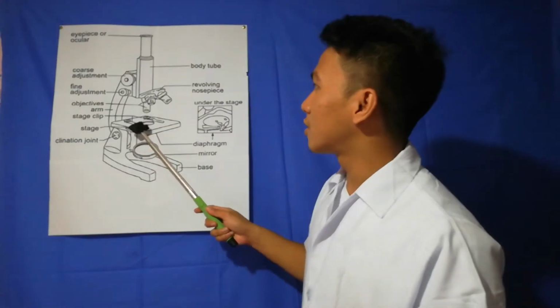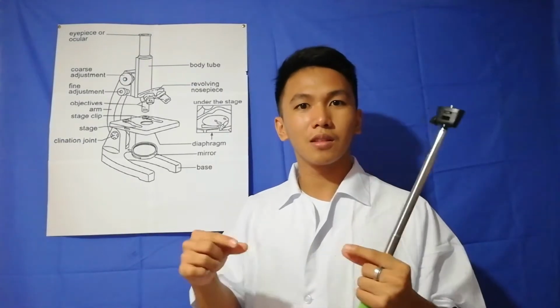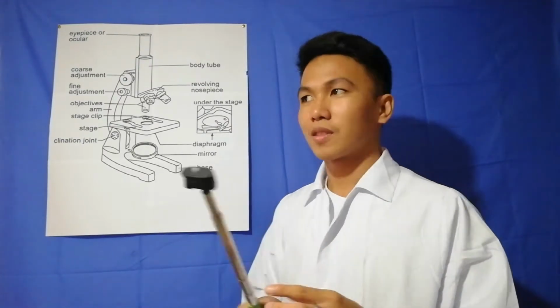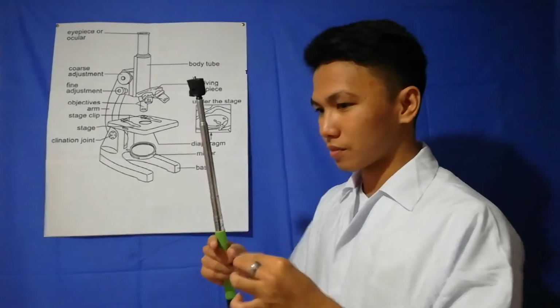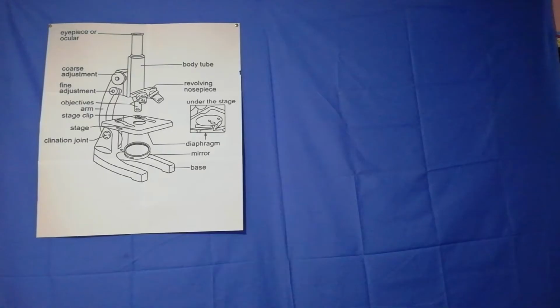Next is the stage clip. So the stage clip holds the glass slide where the specimen will be put.